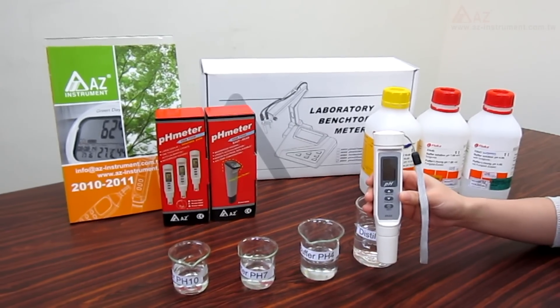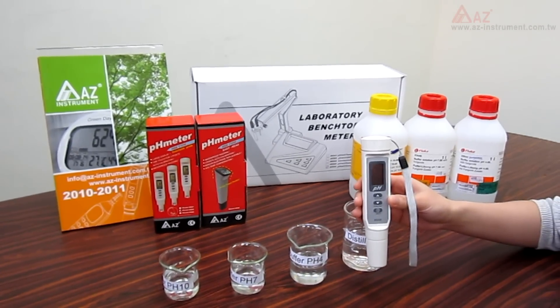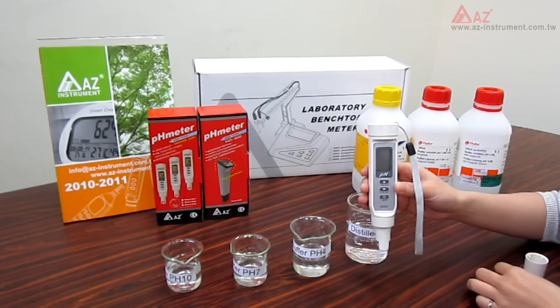In this video, I'm going to show you how to calibrate the AZ-A688 pH meter. This meter features automatic calibration, and users can easily do it in a few minutes.